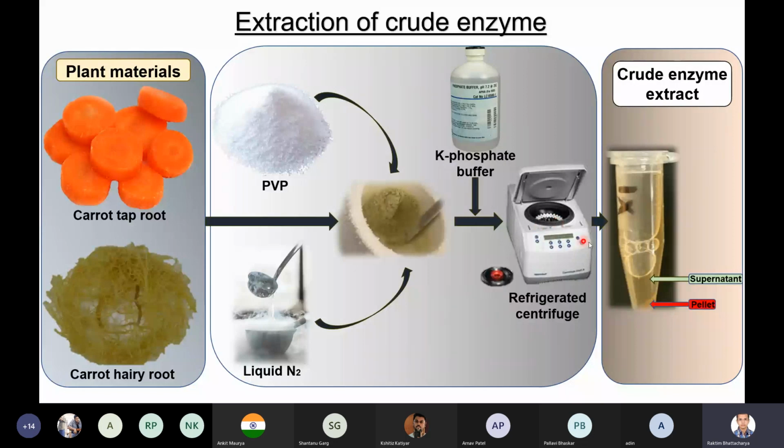The centrifuge temperature will be set at 4 degrees Celsius. You know, 4 degrees Celsius is actually a refrigeration temperature. Our normal fridges are kept at 4 degrees Celsius. At this temperature, the enzymes will become dormant, but they will not degrade. They will not be active, they will not degrade, they will become dormant. We need them exactly that way.